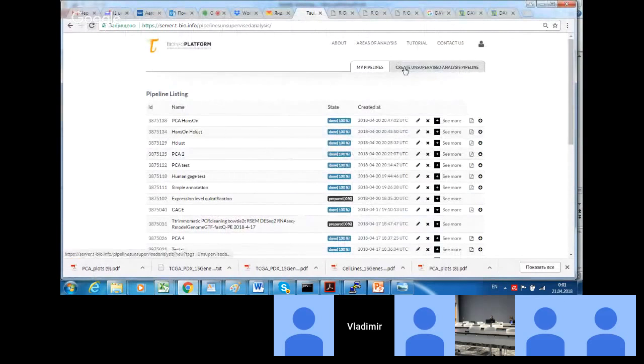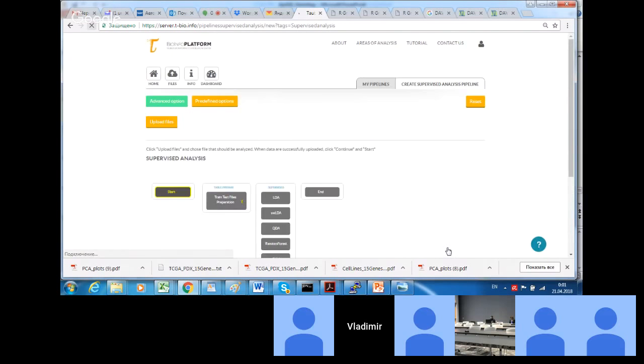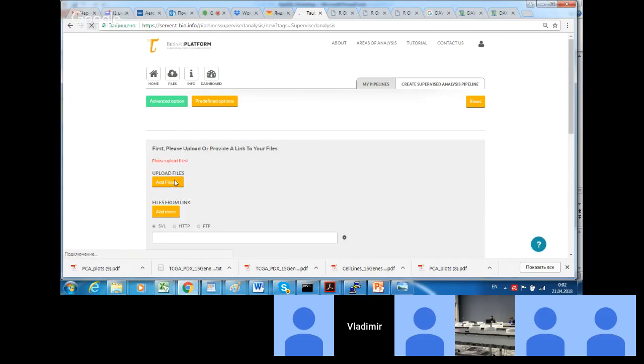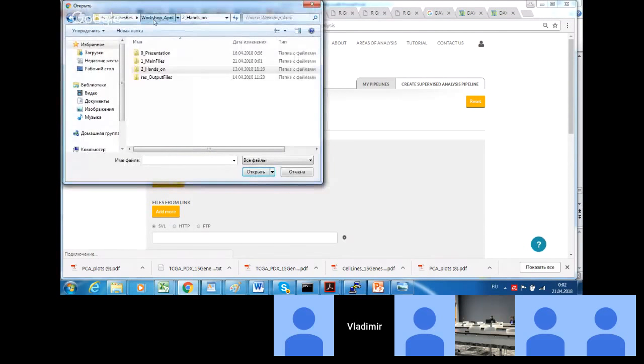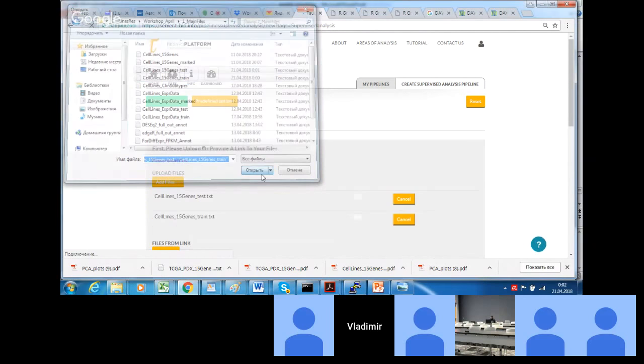So in order to construct a classifier, a function which is able to deal with new samples, we need to use the supervised analysis section of the platform, and the usage is quite simple. We upload a training set, we upload a test set.